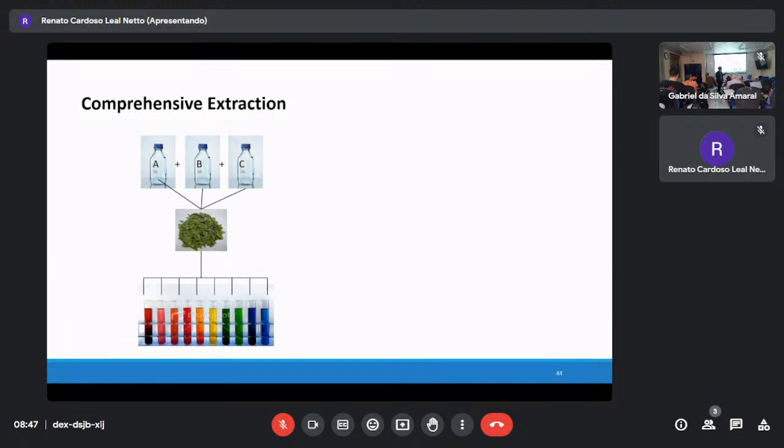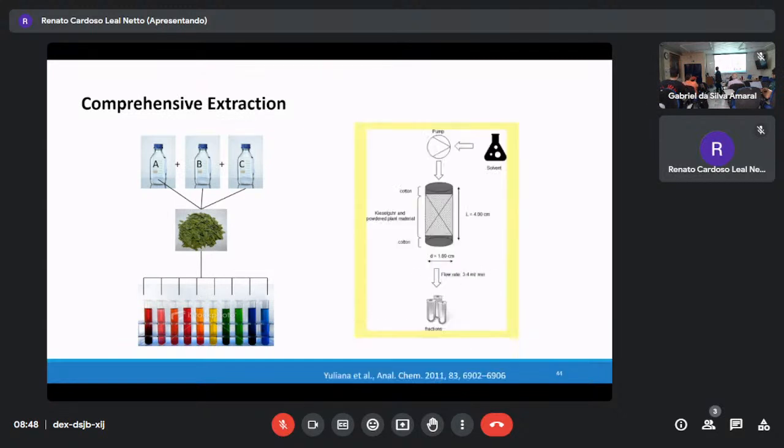In that case, one sample can produce several extracts, so at least you can increase the number of data points, if you are talking about activity correlation. Do you understand my question? When I suggest a protocol or methodology, please think about your problem and how to apply it.